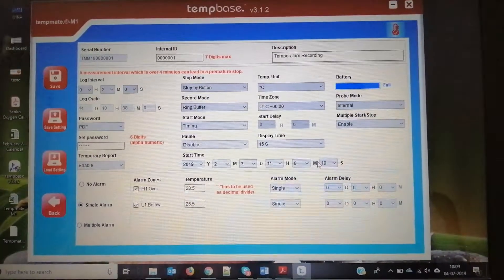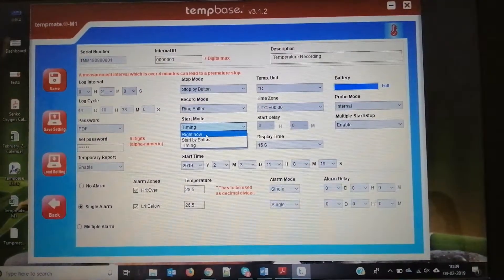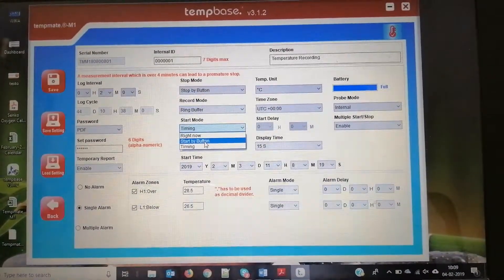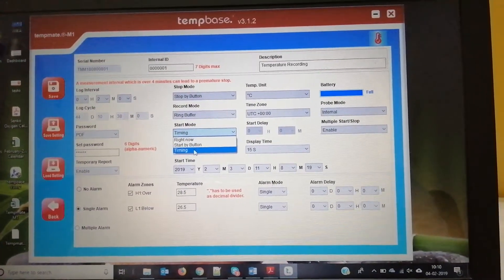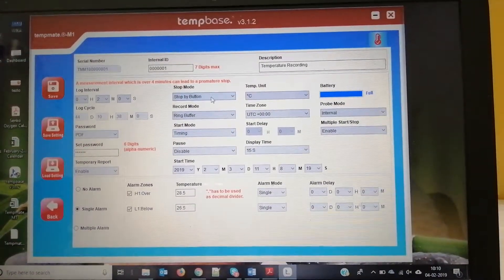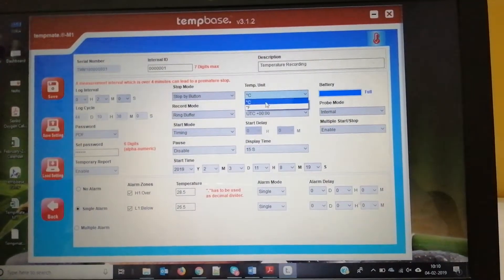This is the start time. You can start the data logger by three ways: right now — as soon as you remove the data logger from the PC it will start; start by button — meaning manual intervention using the key; or by timing — you can set a specific time after which the data logger will start. For stopping, there are two modes: stop by button or stop by software.